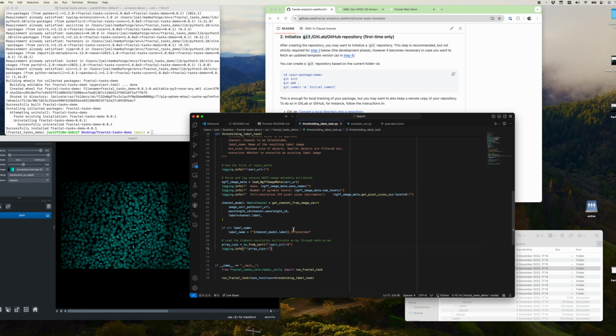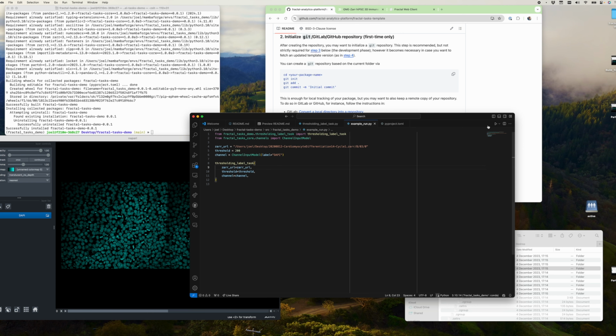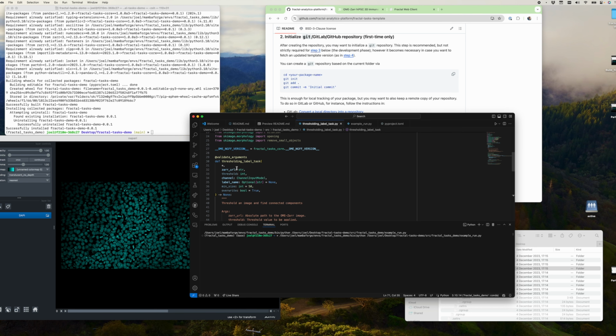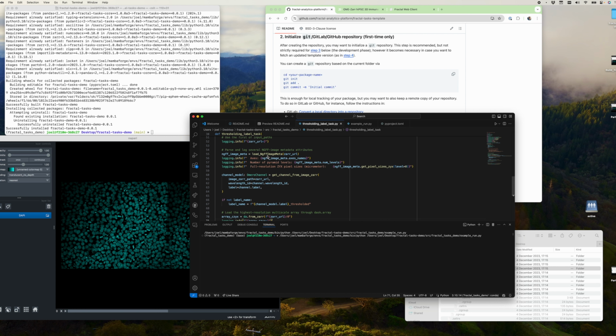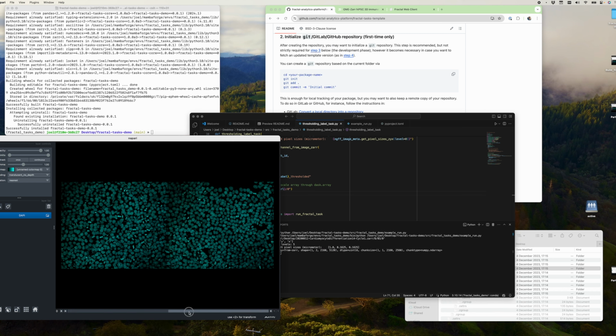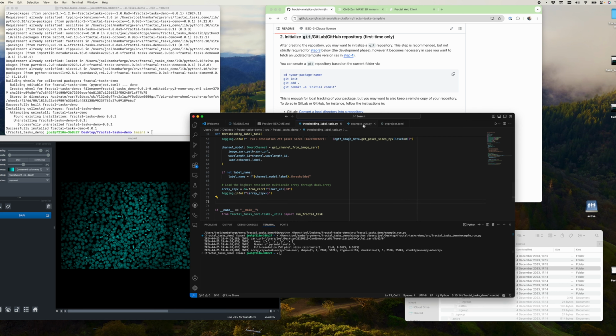We should see, if we run this task, some logging info about our array. So let's see if the first part of our task can successfully run. So this task now goes. It will get the Zarr URL to know where the Zarr file is, load some metadata, load the channels, and then lazily load the array. And we see that we have some array loaded. It's a bit wider than high. It has 2 Z planes, as we see over here. So we know we have an image to deal with.